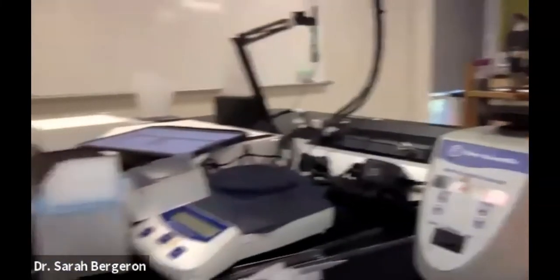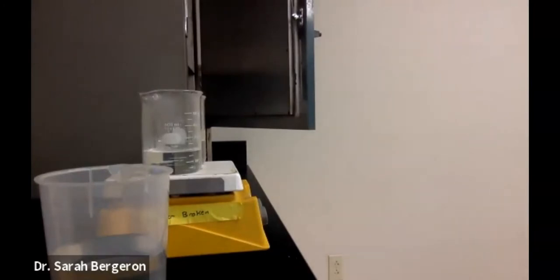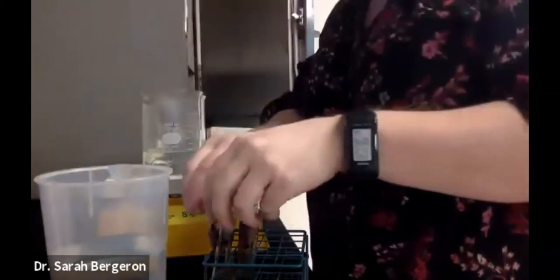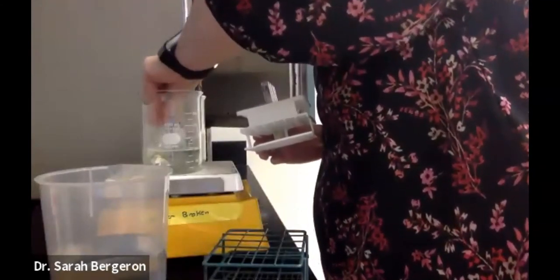Okay. Now what we are going to do, I'm going to take them over here. I'm going to take you with me. Let's see. And we're going to put them over here inside of these beakers that are sitting on the hot plate. So what we want to do is put them in very carefully. Samples in one, and then we'll put our standards in the other. So we need to let these go about 5 minutes. So here are our standards. You can see our standards are starting to change a little bit too. I'm going to tilt them.